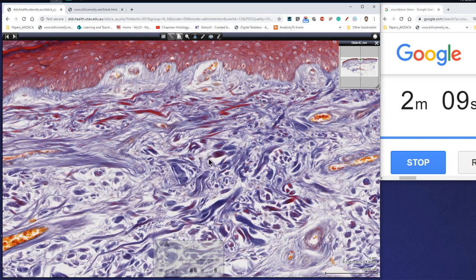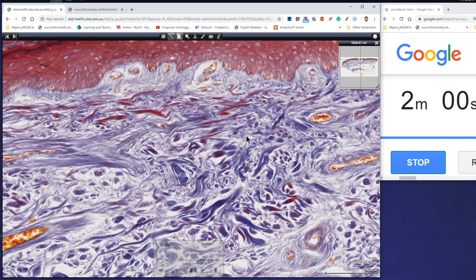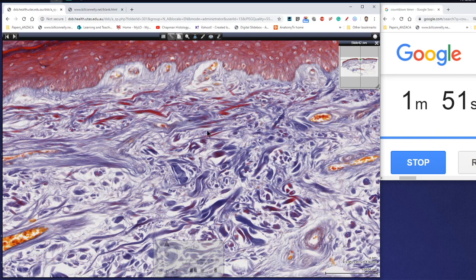There would have been some ground substance here, but largely we've got all of these dense irregular connective tissue fibers running in many different directions. And of course that enables skin to withstand forces from many different directions. We can also have elastic fibers helping to provide elasticity to that deformation and reformation of this connective tissue.